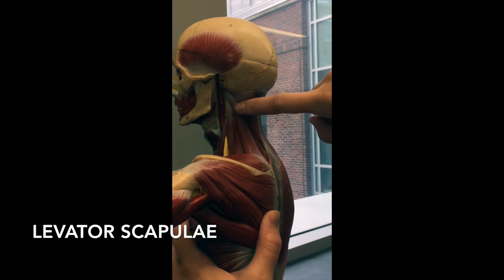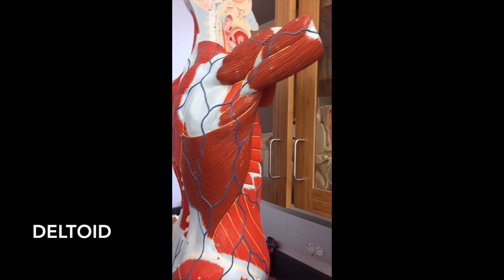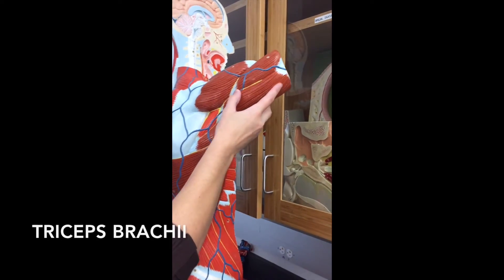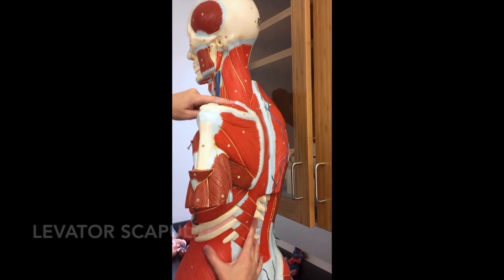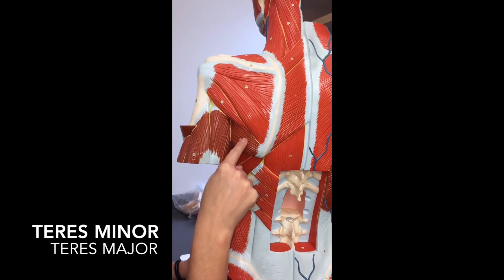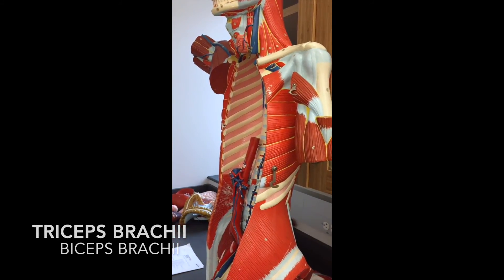The only other one is going to be the levator scapulae, which connects your skull — probably the mastoid or temporal bone — down to your scapula. On the last torso: deltoid is here, teres minor here, teres major here, and this is the tricep in the back. You also have your levator scapulae here. On this side you can see the supraspinatus, infraspinatus, teres minor, teres major, and triceps brachii. You can see a little bit of brachialis muscle and biceps brachii, and here is the levator scapulae.